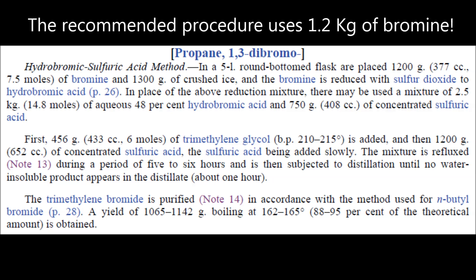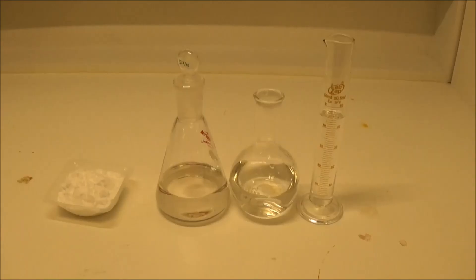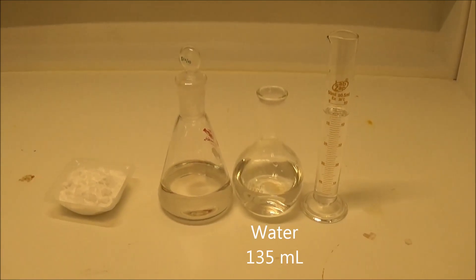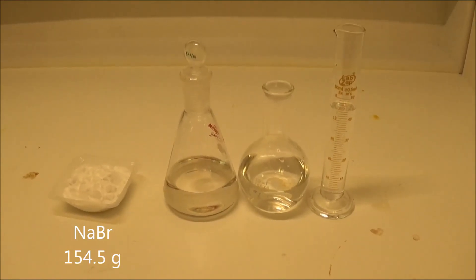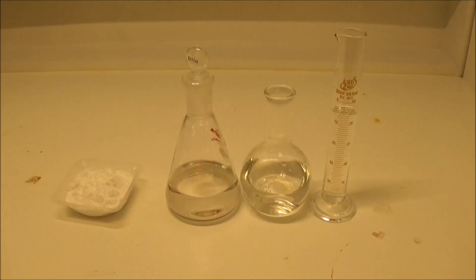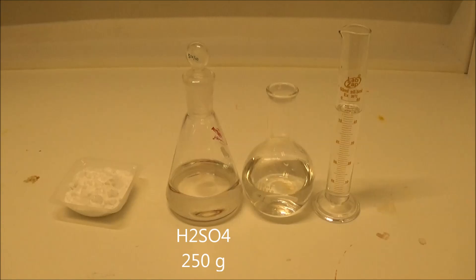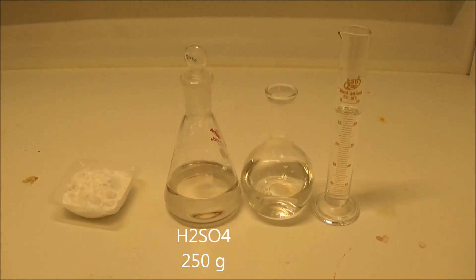I started out with 135 ml of water, 154.5 grams of sodium bromide, 45.6 grams of 1,3-propane diol, and 250 grams of concentrated sulfuric acid.